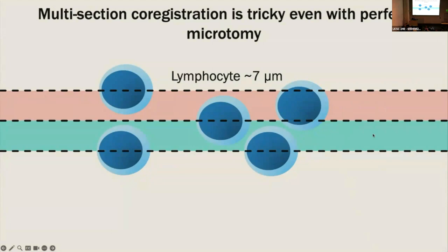Let's say a multiplex imager, then theoretically at least, the co-registration for that modality should be perfect within that modality because it's multiple things in one layer, right?